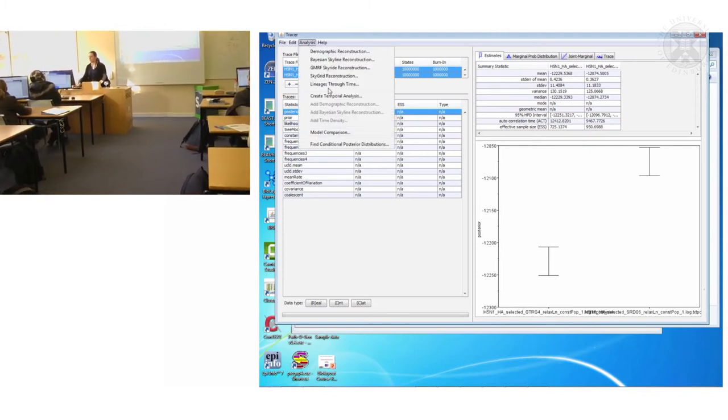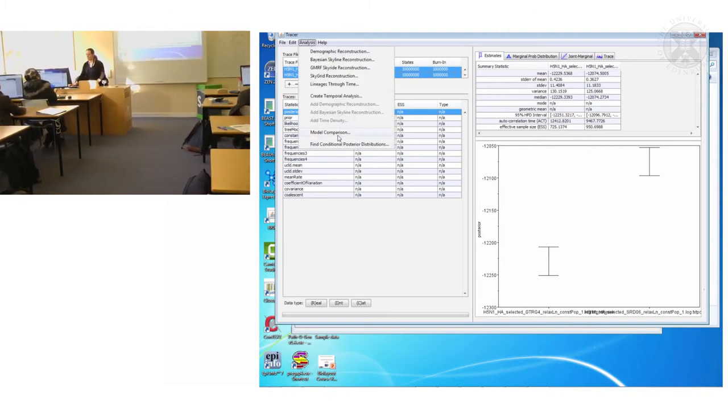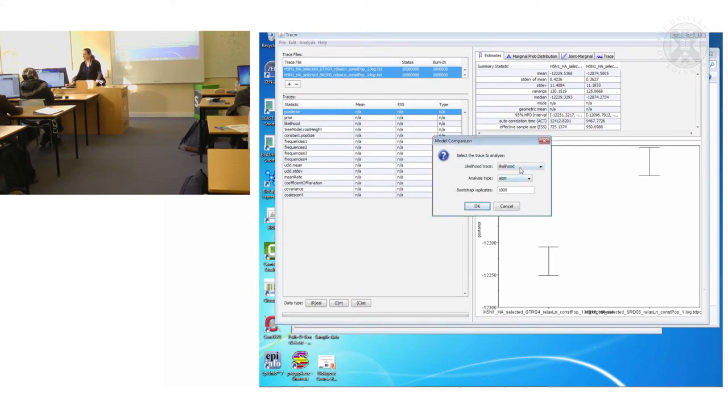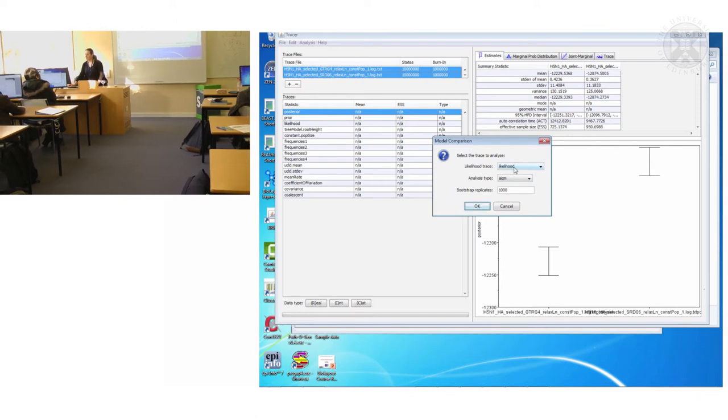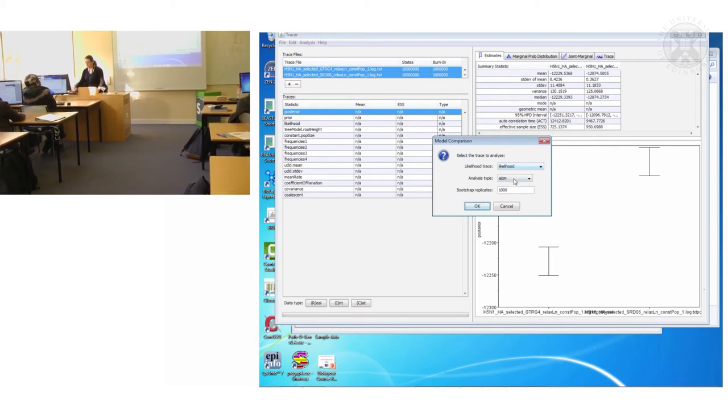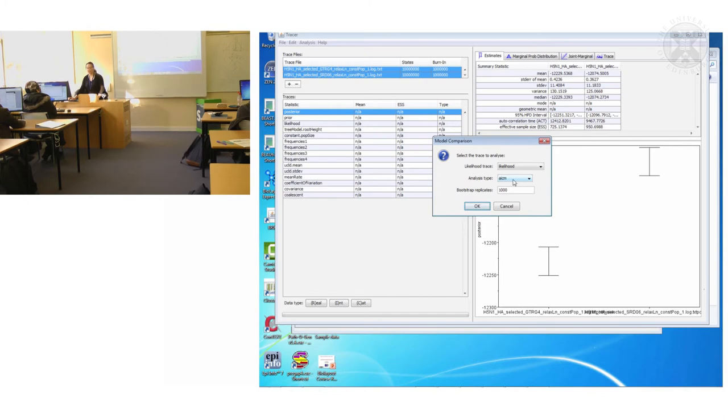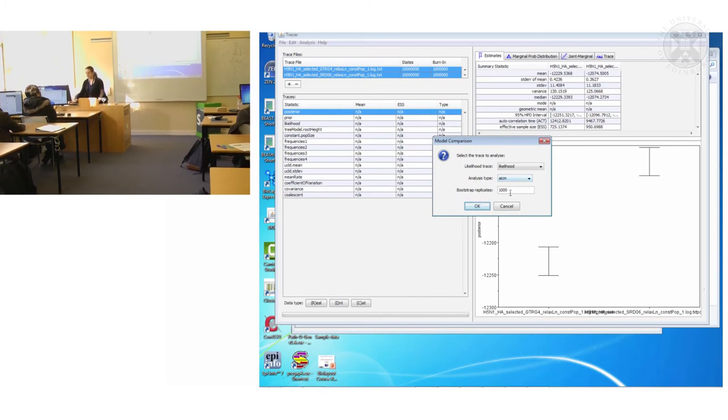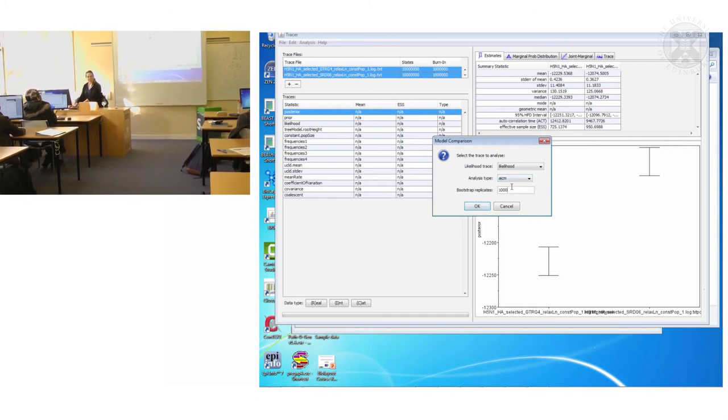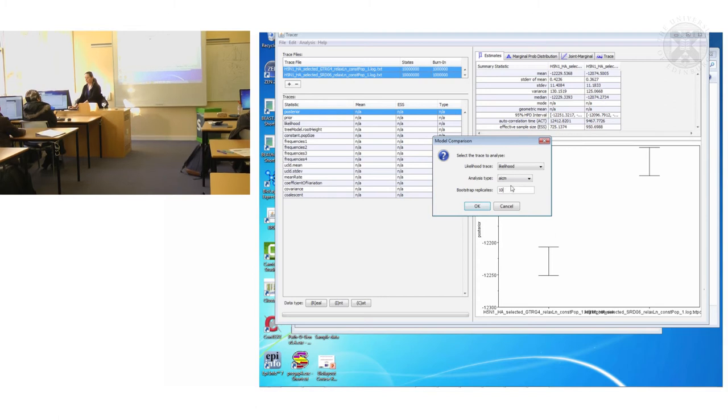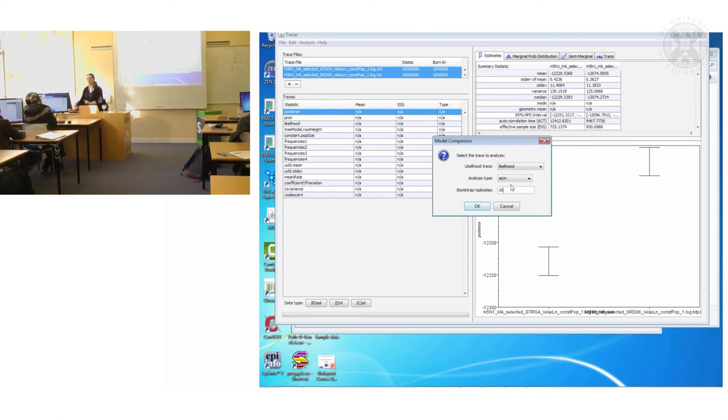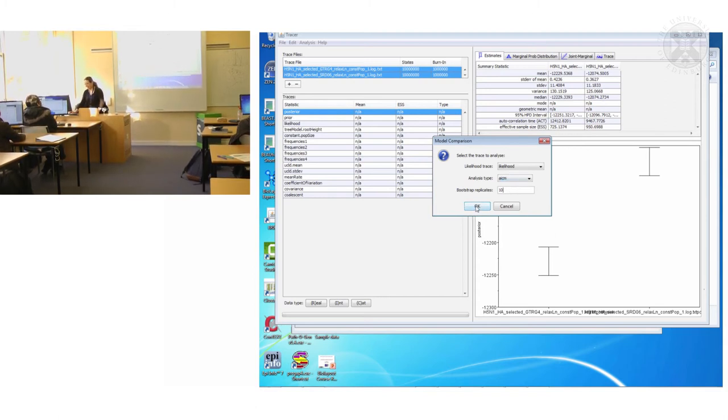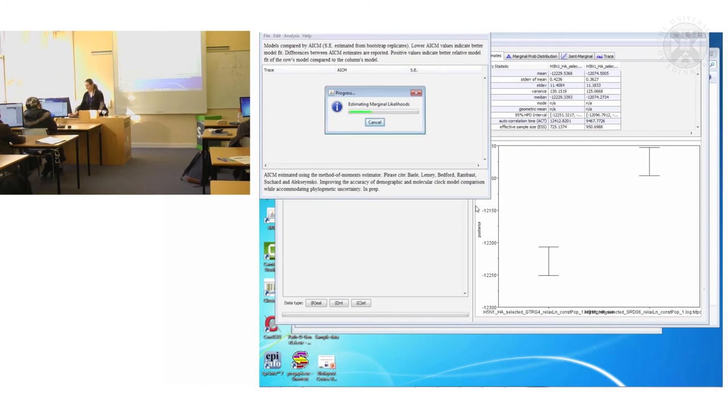So I would like to do a model comparison to see if one is truly better than the other. And we will do it on the likelihood trace we'll compare the likelihoods we will use the AICM analysis type. For the purposes of this and speed I will just drop down my bootstrap replicates and I'll click OK.